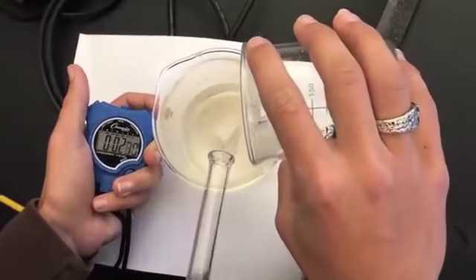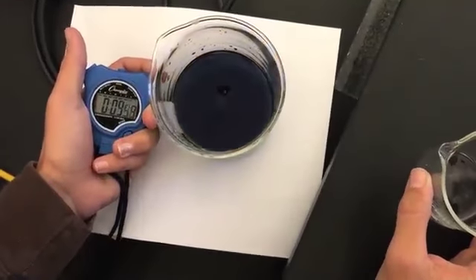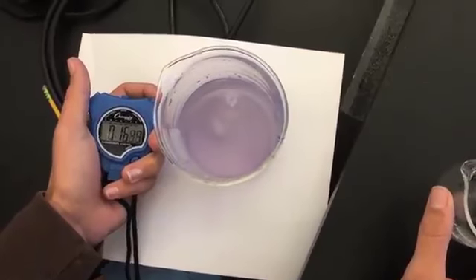This is an example of a competing reaction. Initially, the yellow species begins to form. As the yellow species reaction progresses, a catalyst for the black species reaction is generated. Eventually, the black species reaction dominates and the solution turns black.